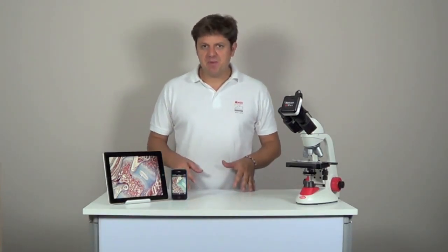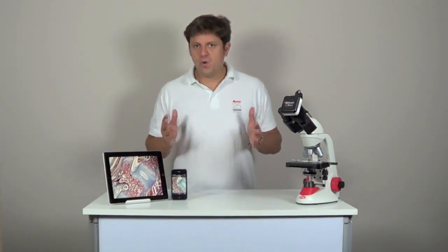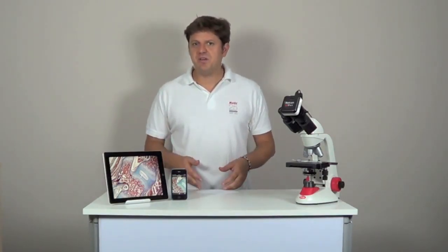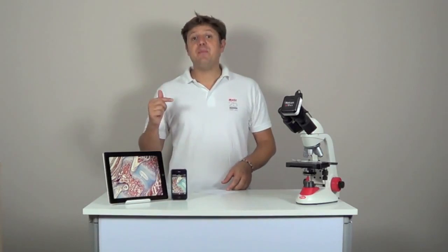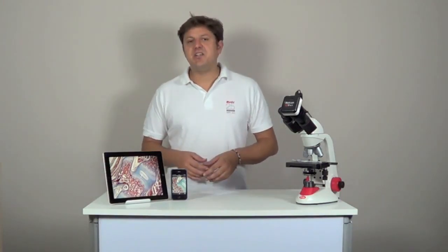Maticam X is a WiFi camera with a resolution of 1.3 megapixels. It streams images with its own signal, and up to 6 devices can be connected at the same time, be it tablets, smartphones or computers. When working with a computer you can simply use our popular software Maticam Images Plus 2.0. When working with a tablet or smartphone, you should download our free app Maticonnect from Google Play or App Store, and you will be able to capture, edit and share your microscope images.